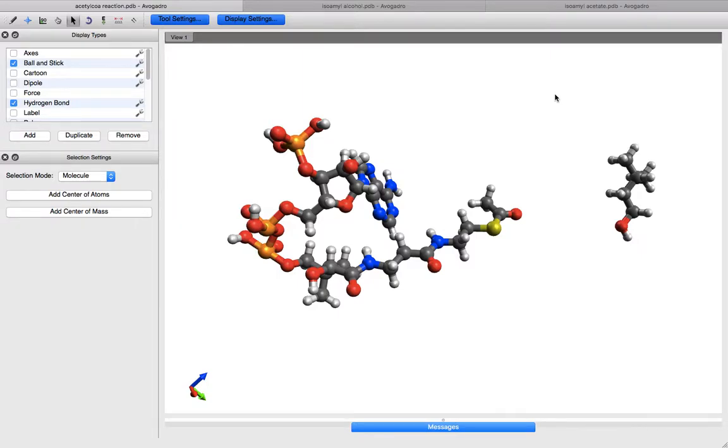Hello everybody, this is a short video that describes the banana smell enzyme processing kit by Amino Labs. Within this video, we're not going to show the enzyme, but we're going to look at the underlying chemistry that happens to convert isoamyl alcohol, which doesn't really smell, into isoamyl acetate, which does smell.